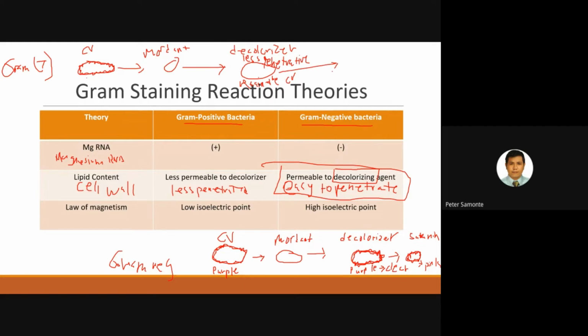And now, you would add your counter stain, your safranin. What would happen now? Anyone? So if you add your safranin, what happens to the safranin? So retained yung crystal violet sa cell wall.